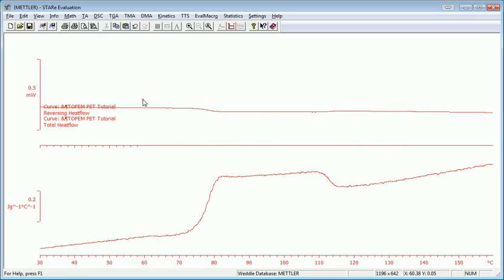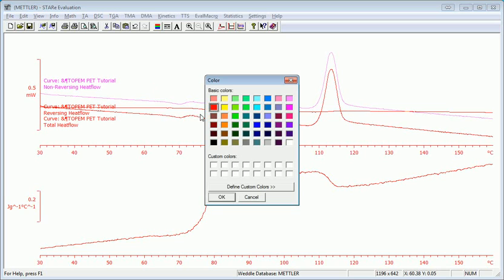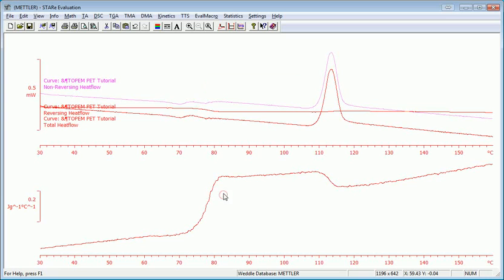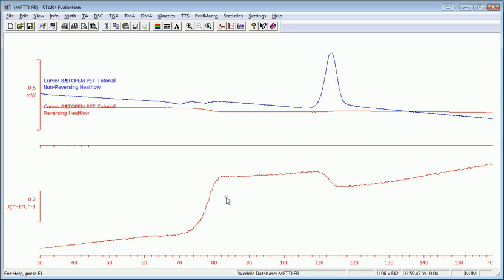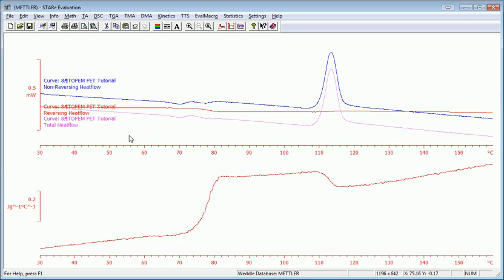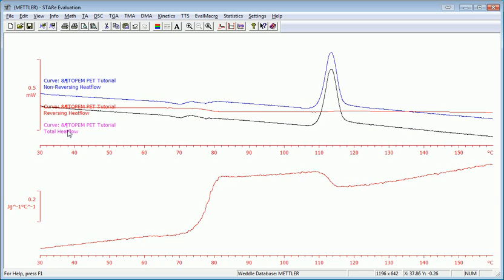And we'll just double click on these and change the colors. Make one of them blue. And one of them black. And it's easy to identify which is which.